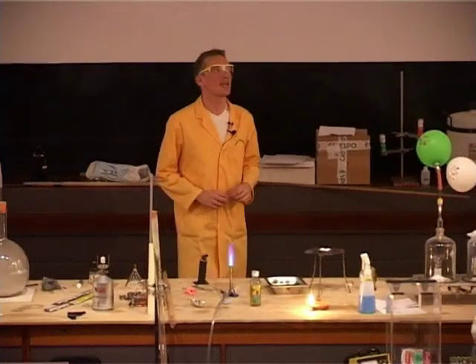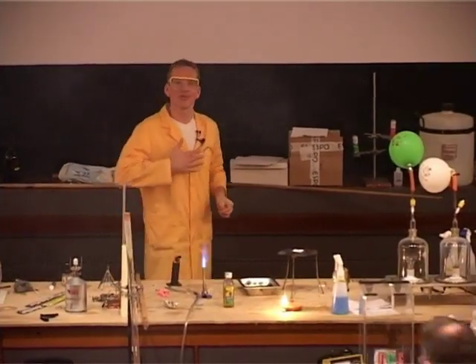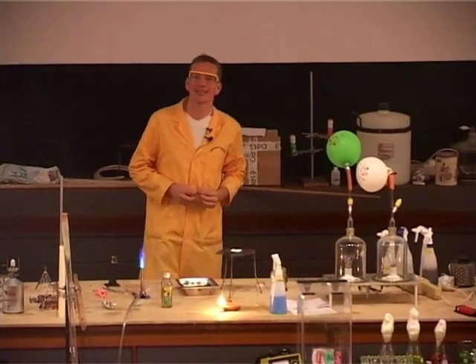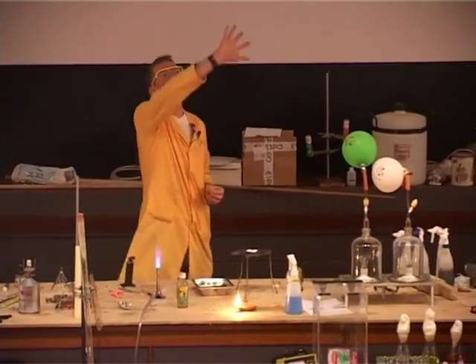And the smoke that's settled to the top of the lecture theatre there, well, this is the same sort of thing that you'd have if you have indigestion. It's magnesium oxide. You may have heard of milk of magnesia that can sometimes settle your stomach if you're feeling a bit ill. Well, this is the smoke that you see at the top of the theatre now.